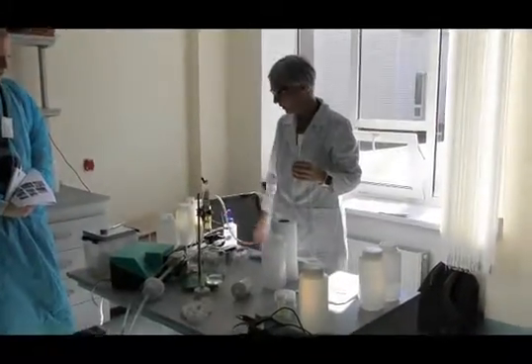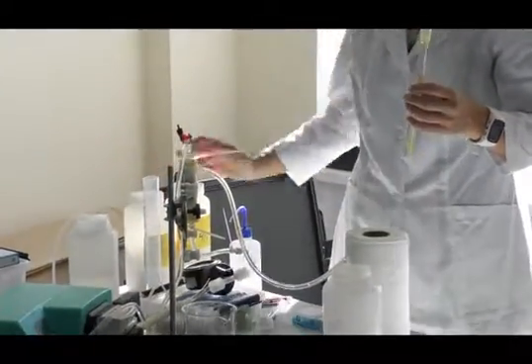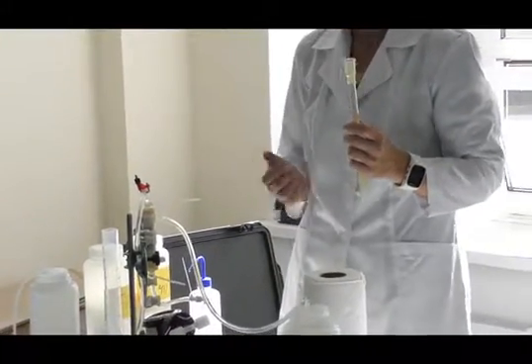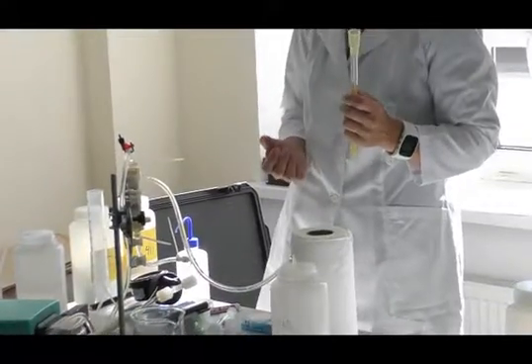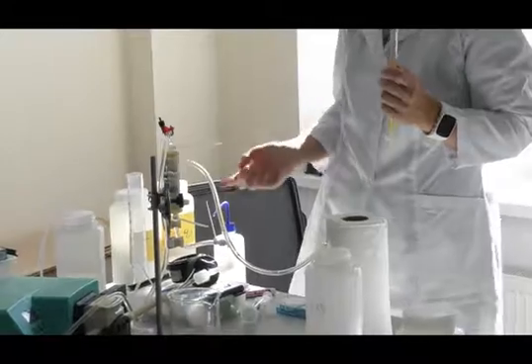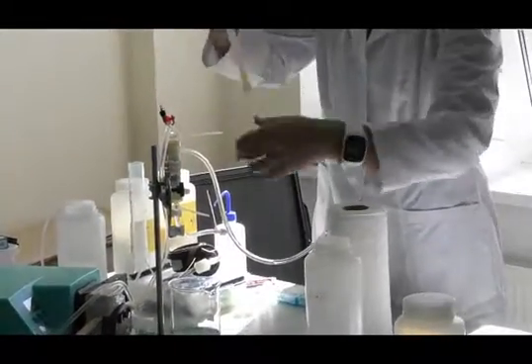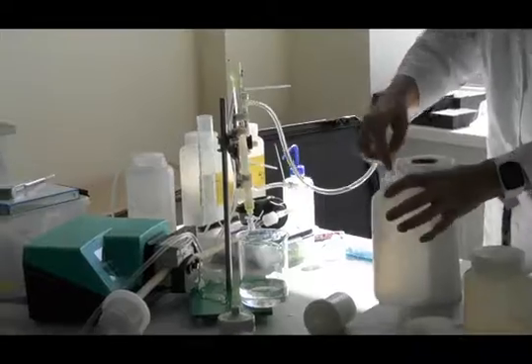Anions and cations. We have found these to be okay, but there are a lot of different ion exchange resins. So you just need to pick one and see if that is a good one for your purposes. This is a strong anion and a strong cation resin. So you just add that to a column, and we take from the less than 10 kilodalton fraction.